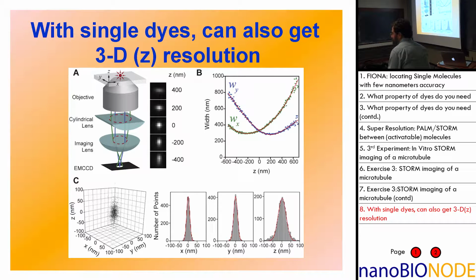It should have a Gaussian distribution. And then the further out of focus you are, the more elongated it is, pushed in a certain direction. So as you defocus, your XY precision will change relative to each other. In the minus one, your Y is going to be a lot bigger than your other positions because the Gaussian spreads out more. So you can use the difference between them to correlate with how far away, like the actual sign. I guess maybe you need a control spot somewhere around there.